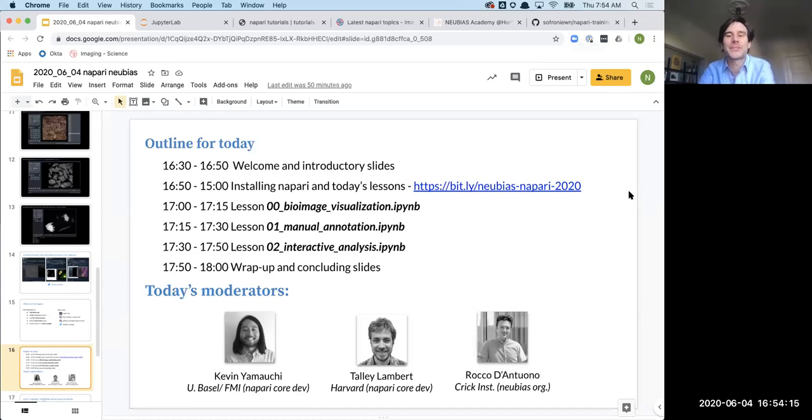Yeah, thanks, Sally. Okay, so as was just mentioned, one of the things that characterizes the image analysis space is the heterogeneity of file formats. And in napari right now, we have done some work to make a plugin interface where you can write your own file loader if you want. We have built-in support for the standard, let's say non-proprietary, formats, so TIFFs, JPEGs, PNGs, things like that. And for some of the more vendor-specific formats, people have been working on plugins. Right now, an incredible one has come from the Allen Cell Institute, the AICS, for reading CZI, Zeiss files.